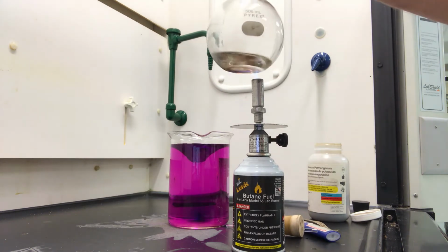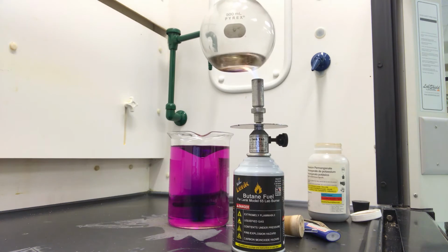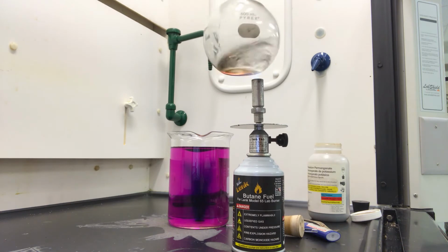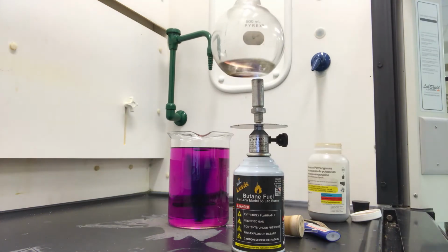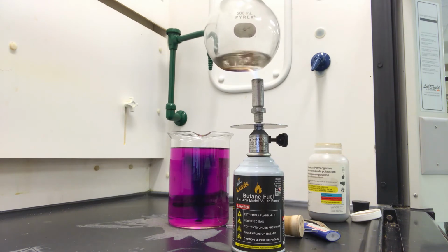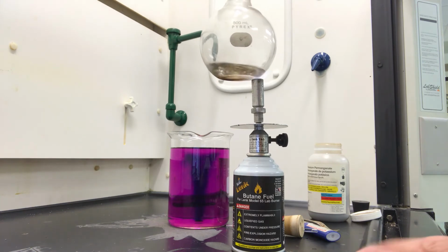Okay, I don't know if you guys can see the bubbles. The ammonia gas is starting to be released in those bubbles there, filling up this top. There's still a little bit of air there, but I want to get as much ammonia as possible. Now, you guys can see the flame, but I don't want you to think that that temperature is... Well, I'm not going to give you the answer to that one. Okay, the experiment is going to start after I've heated it.